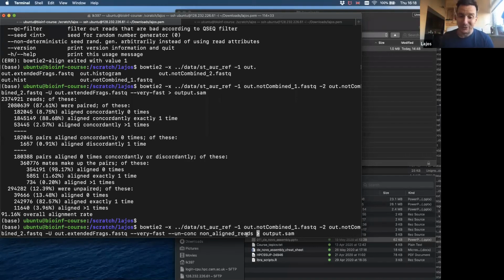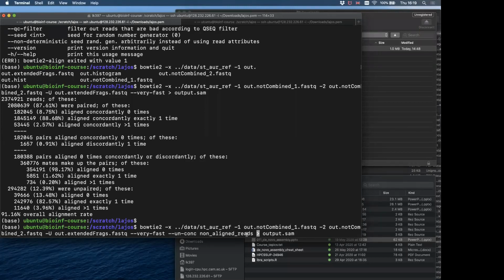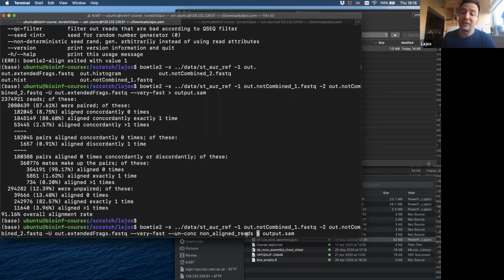I wouldn't use any kind of realignment technique in metagenomics. The only reason to use realignment in metagenomics is if you really want to find your genome of interest. If you know that in your sample there has to be an E. coli, then you can use an E. coli reference genome and find all those reads that are aligning to the E. coli, and then build up your E. coli and try to find the MLST, for example, the sequence type of your E. coli within that sample. But that's only working for those genomes that you know.